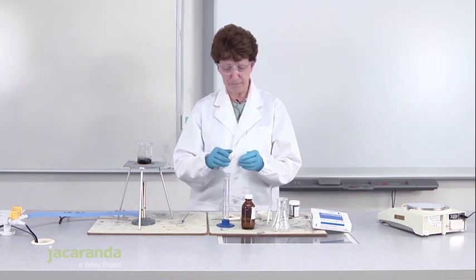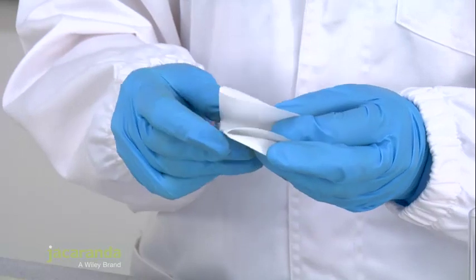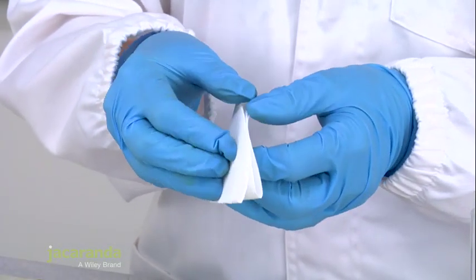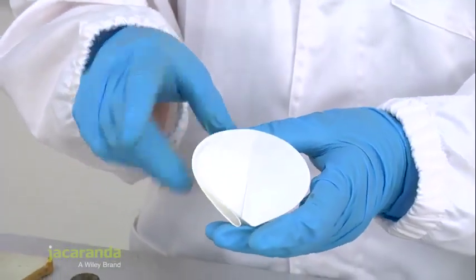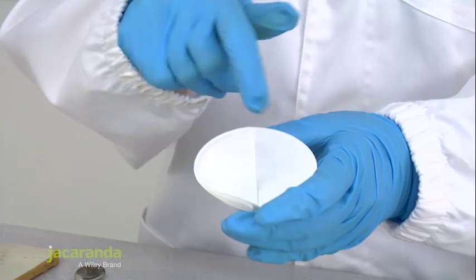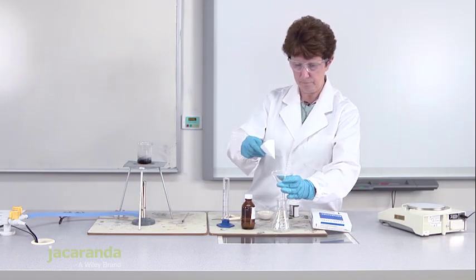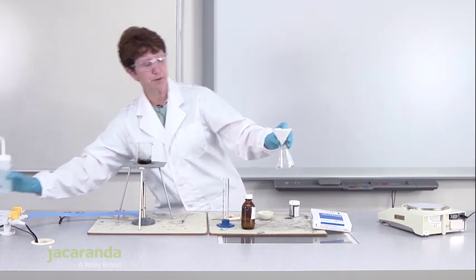So we need to filter out our solution using a filter paper and to do that we need to fold it in four bits, making sure that when we open it out, we have three sections on one side and just one section on the other. We can add a little bit of water to hold the filter paper down.